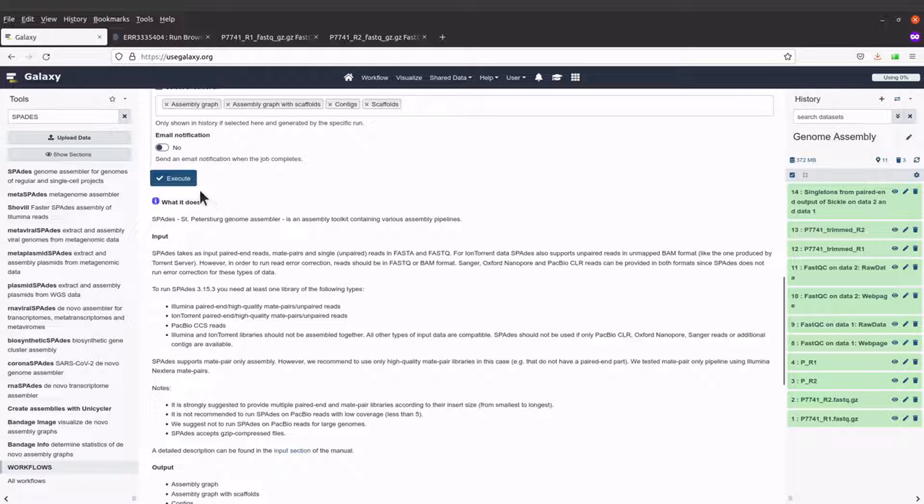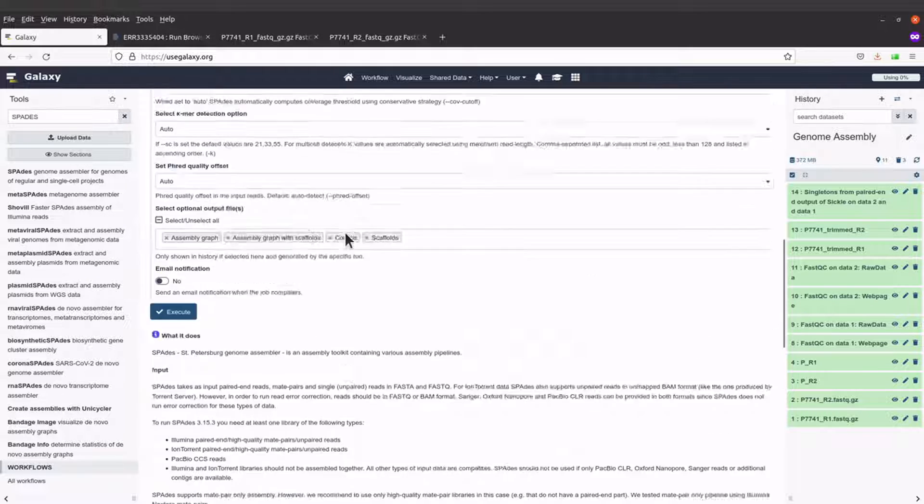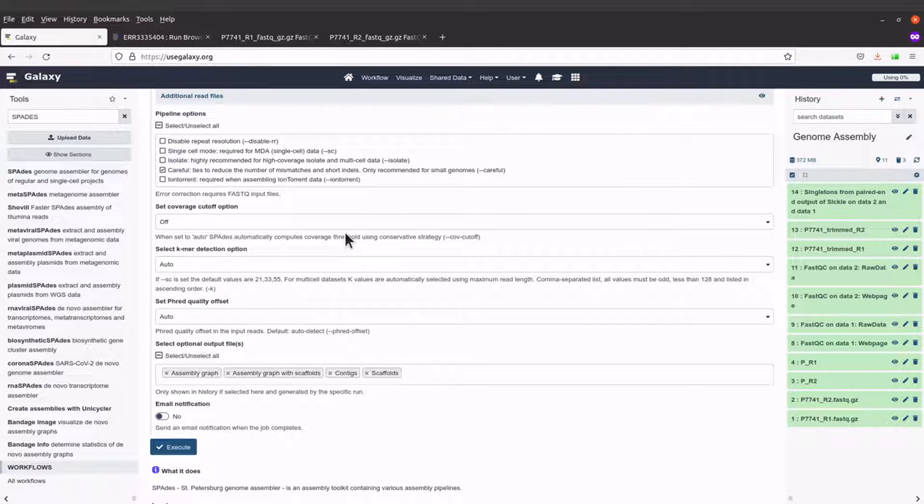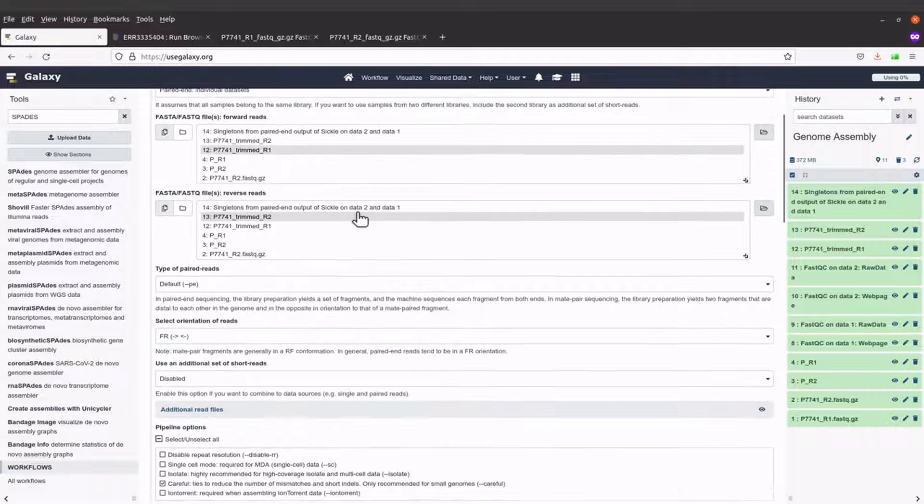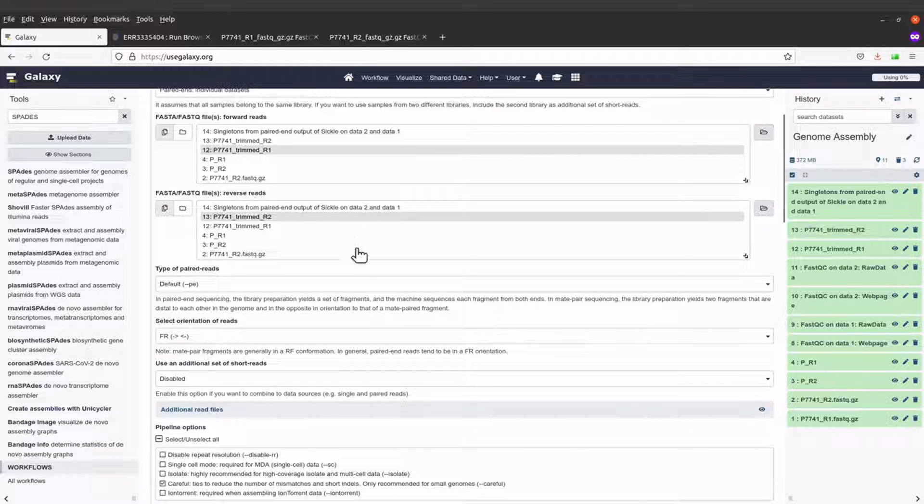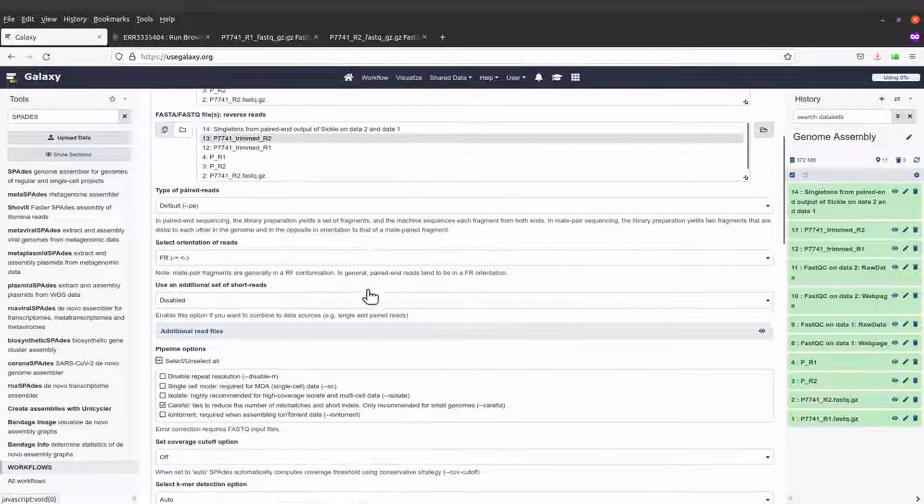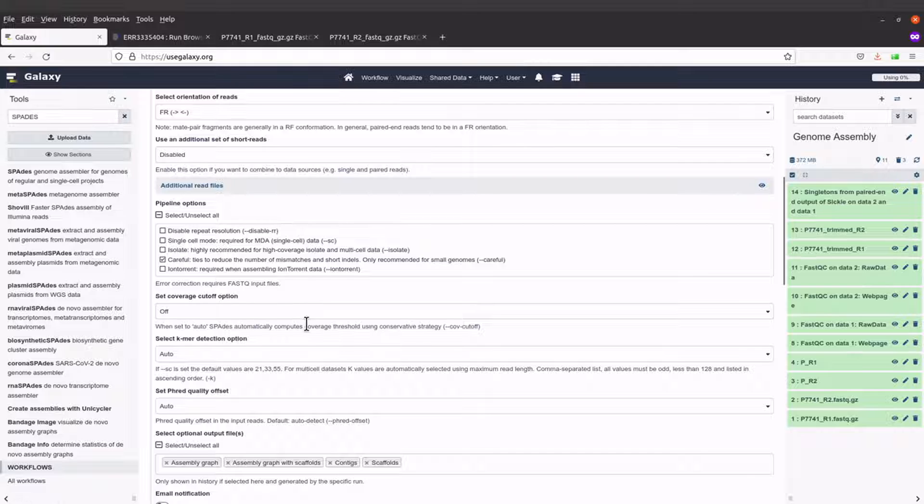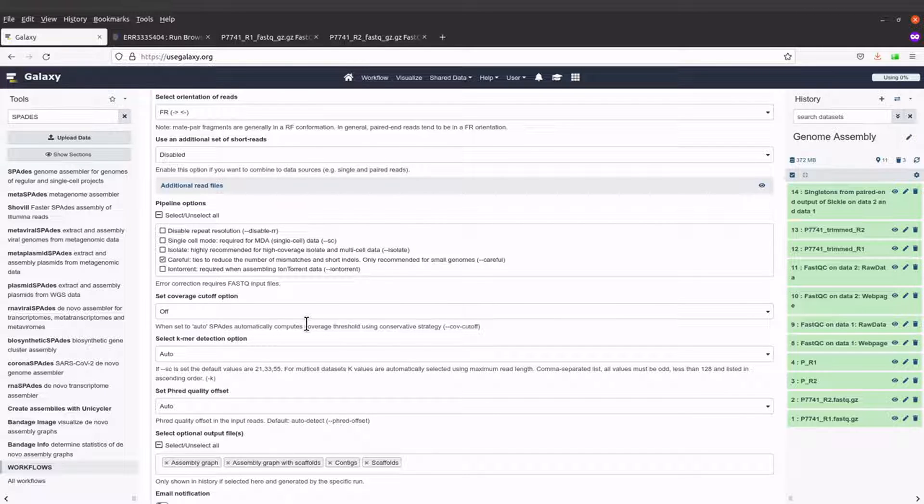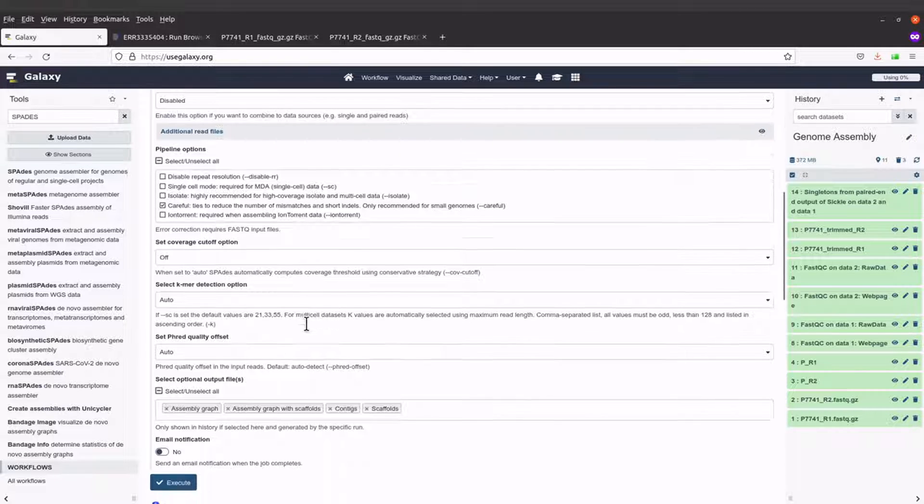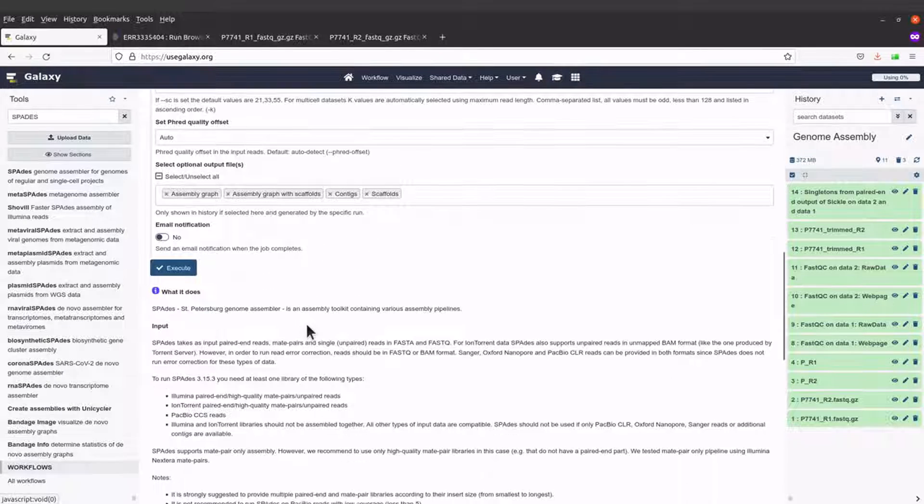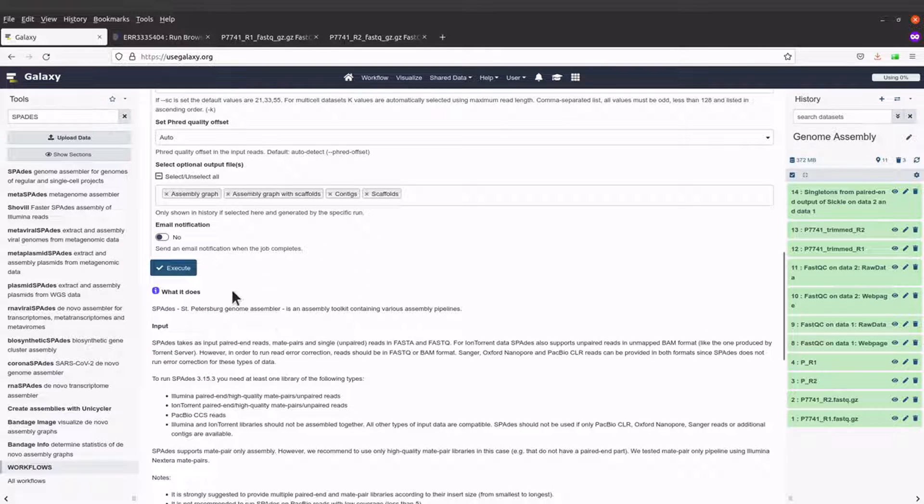I'll just execute. Please know that whatever I'm doing is just an introduction, so you can always read the documentation for SPADES and see if there are parameters here that suit your needs, and then you can select or deselect them.